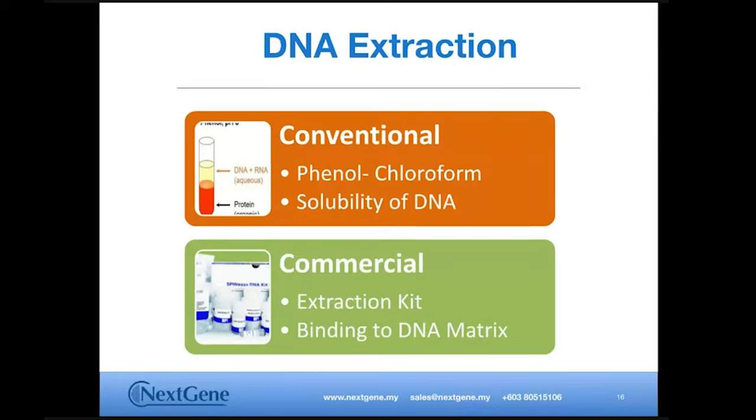In order to overcome these problems, many commercial kits have been developed over the years. Different commercial kits use different buffers and binding matrices that serve different purposes, which we will explore in the following slide.